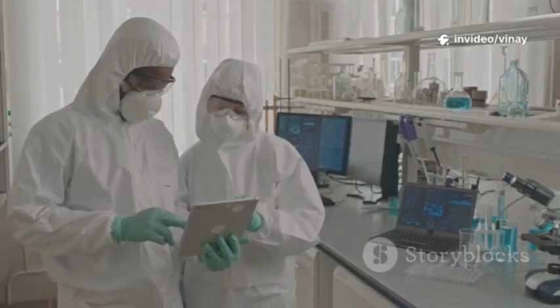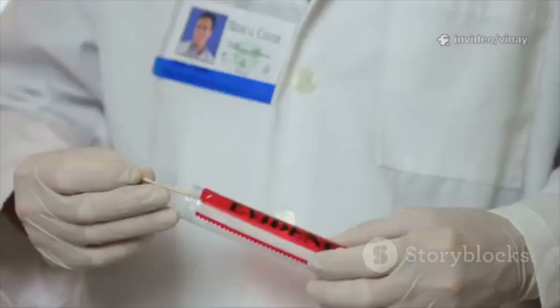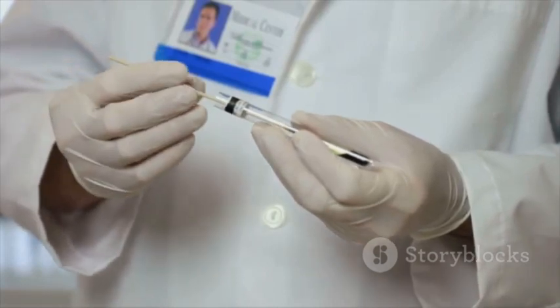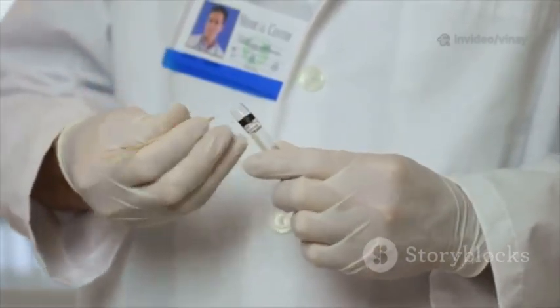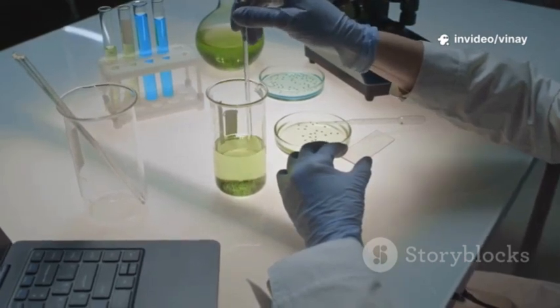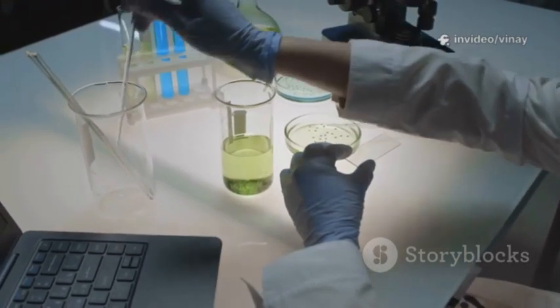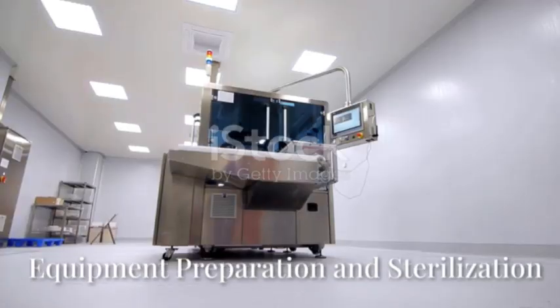The US FDA expects companies to have a robust personnel monitoring program, which includes routinely taking surface samples from operators' gowns, gloves, and face masks after they complete their work in the aseptic area. These samples are then incubated to check for microbial growth, providing objective data on the effectiveness of gowning procedures and operator discipline.